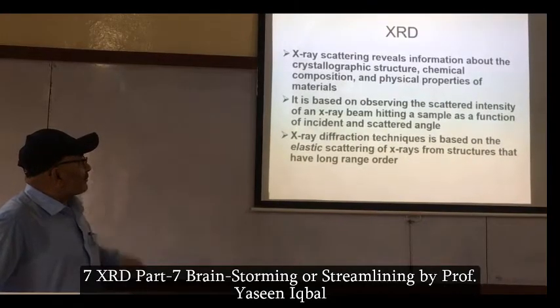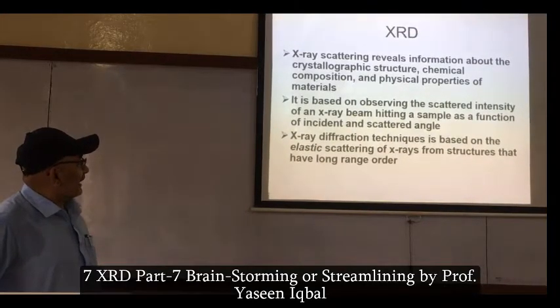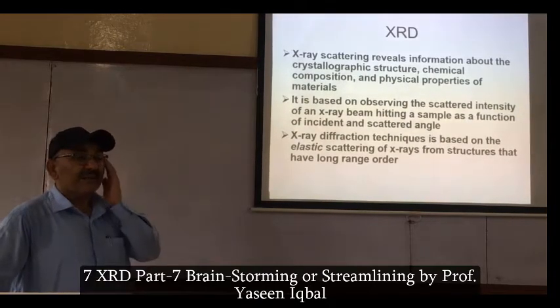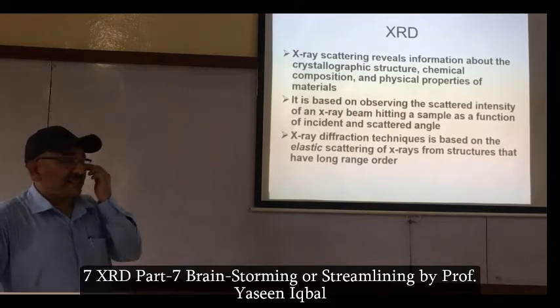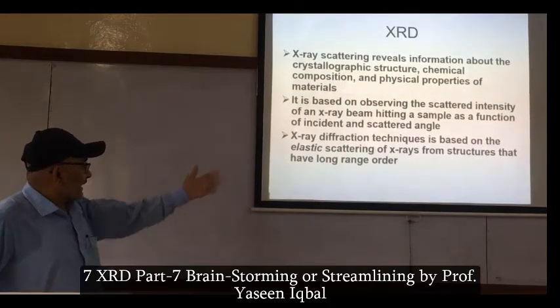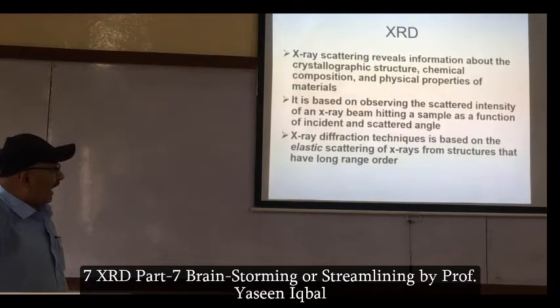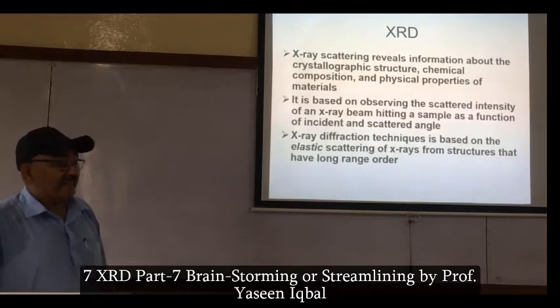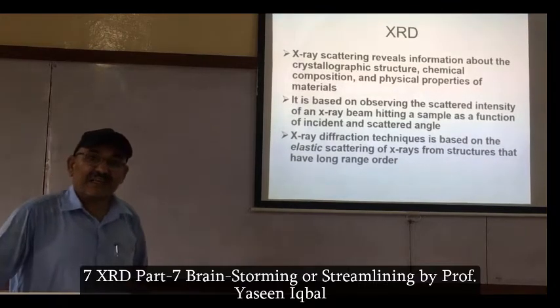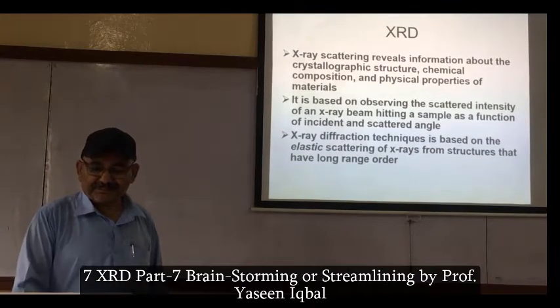It is based on observing the scattered intensity of an X-ray beam hitting a sample as a function of incidence and scattered angle. X-ray diffraction technique is based on elastic scattering. On elastic scattering, remember this.